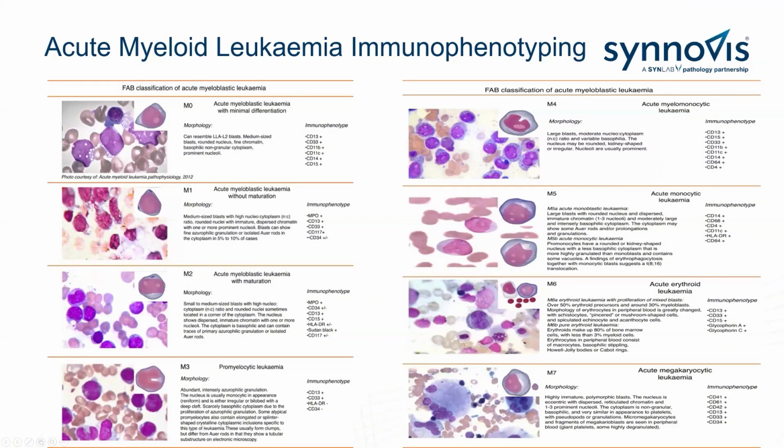So I'm just going to add, you haven't visited Zambia, so you may not be fully aware of this. But for the Zambian team, I know that a lot of you only have the morphology available. So what Conor's done is relate the morphology, and then he's put with them what you might expect to see in those classifications if you had your flow cytometry with them.